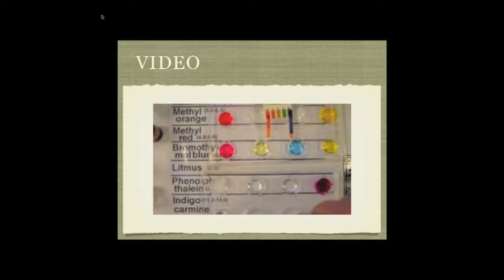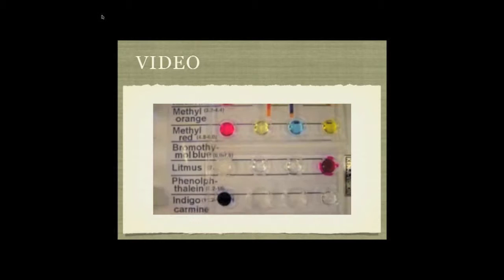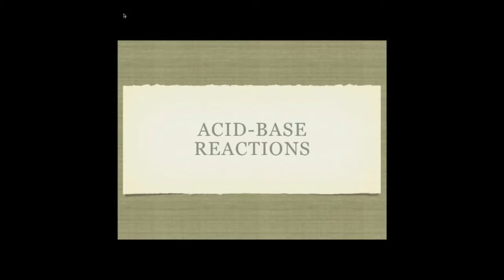Our indigo carmine is a blue solution, and it will stay blue in an acid solution, whereas in a base we get a nice color change.